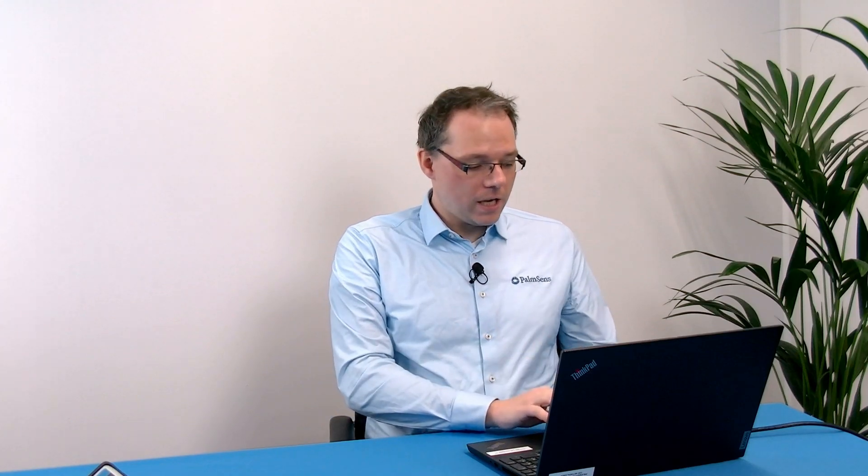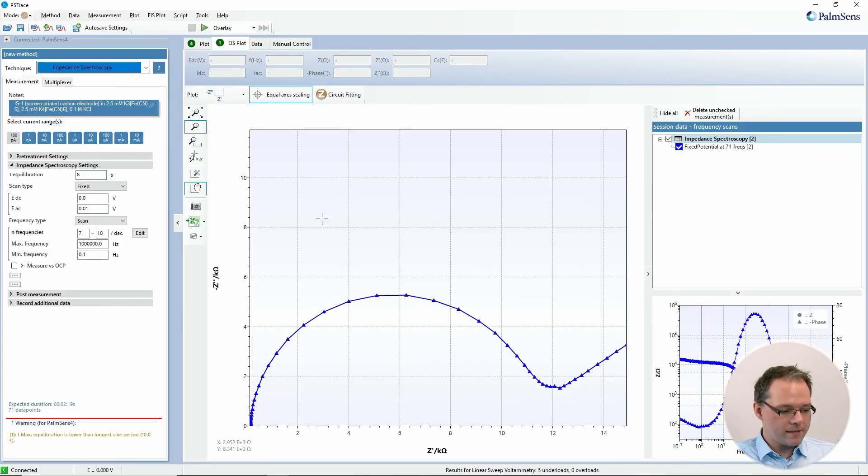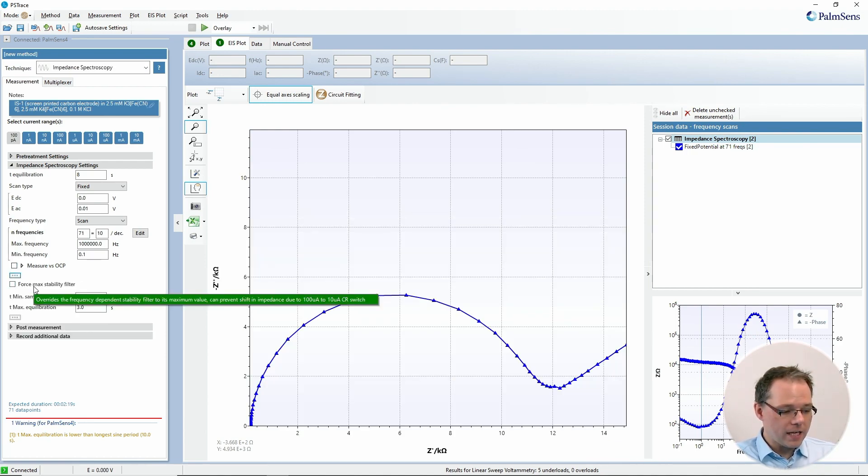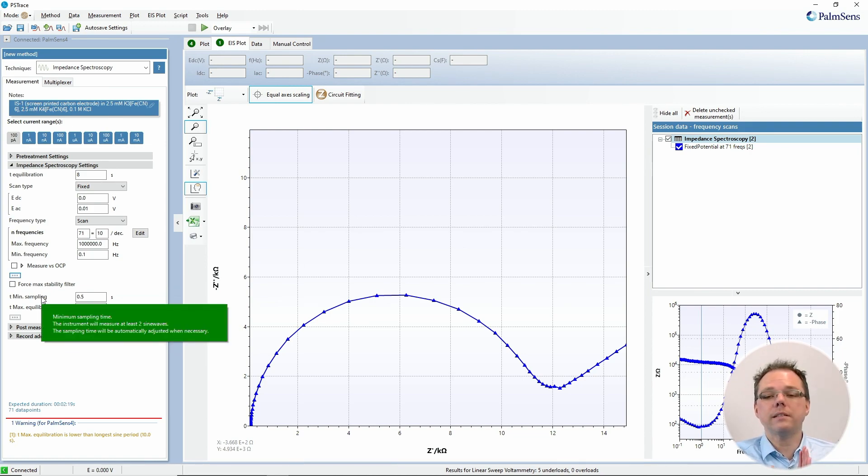Let's have a look at the advanced parameters in PSTrace. There's a special filter that you can activate if you see jumps when you have a current range switch between the 100 microampere and the 10 microampere current range. You can also set the minimum sampling times. At very high frequencies you get very quickly a lot of sine waves and a measurement point is quickly done. If you have a noisy environment and need more waves, you can tell the software for each point at least you need to sample this amount of time.